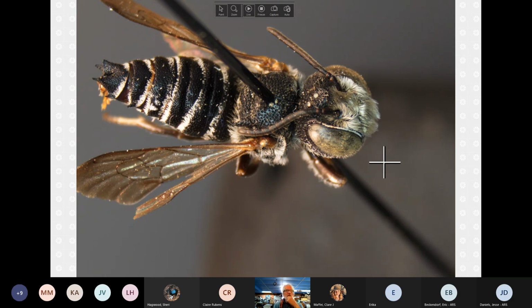Additionally, another feature that the males have that the females do not, that we'll talk about, is not present here, but underneath the eye, if we turn this to the side, and we'll certainly be doing this, there is, you could call it a fovea, but there's a recess that's running from the mandibles directly below the eye on the cheek. And inside that recess are a variety of patterns of hair. So there could be none, it could be lined with hair. There could be a simple strip of hair towards the top. The sayi, which I have on dock here, is the simple strip on top kind of thing.